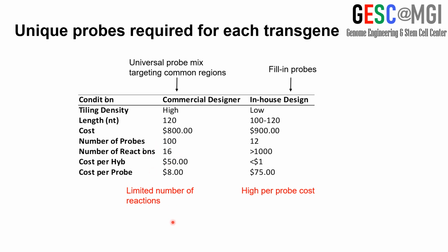Alternatively, you can design in-house designs and have low tiling density and have a limited number of probes. The advantage of this is having a much higher number of reactions available to you. However, the upfront cost is high.